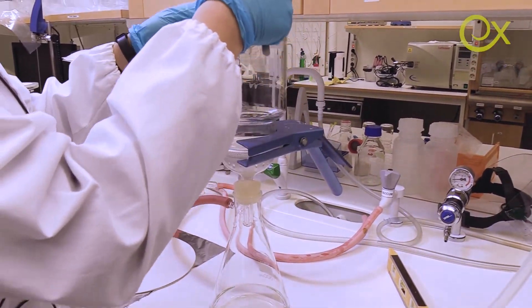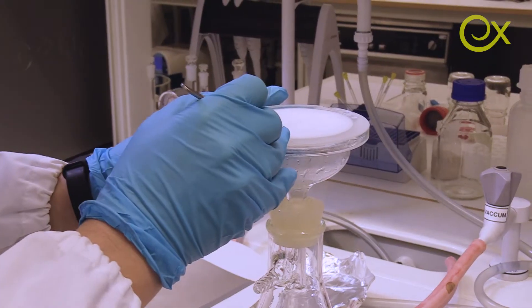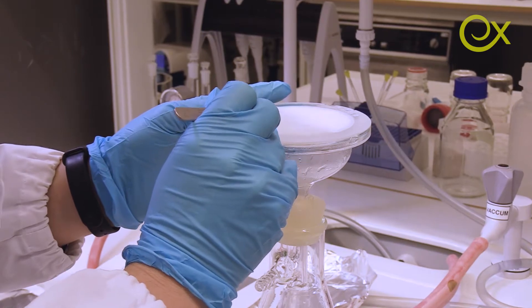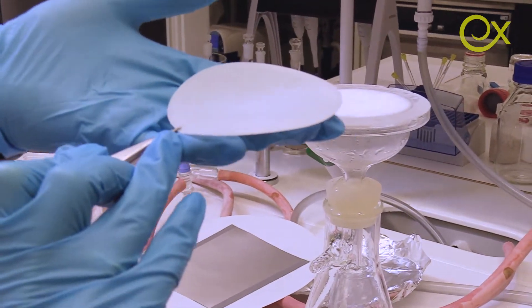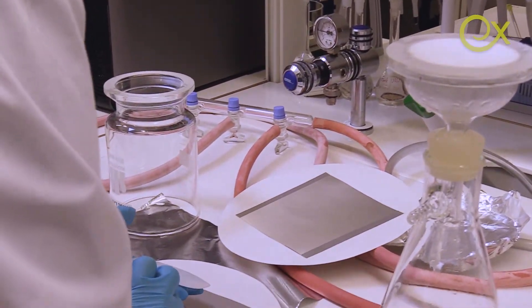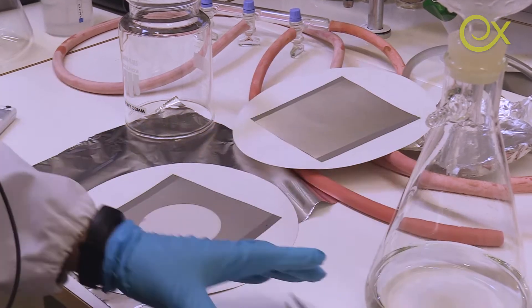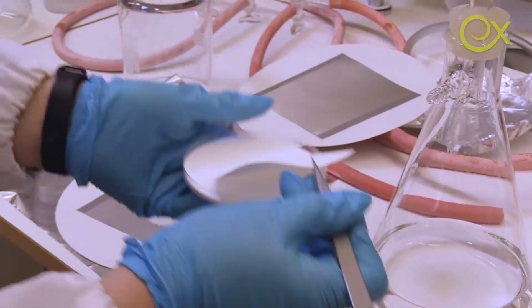Now let's disassemble the unit. Here it is, sitting on top of our membrane. I put the extra membrane on top.